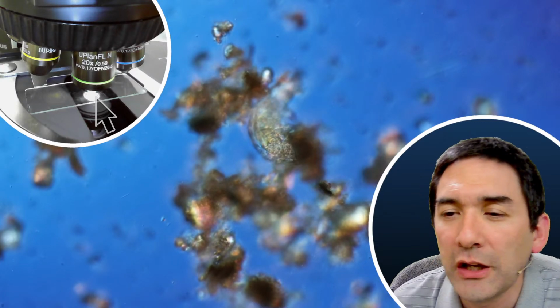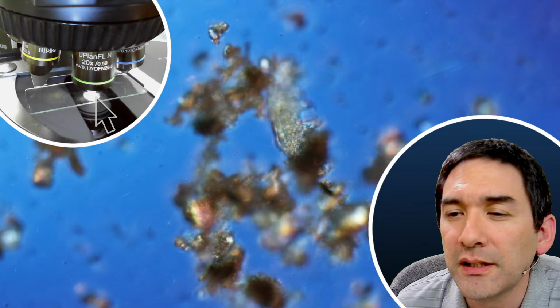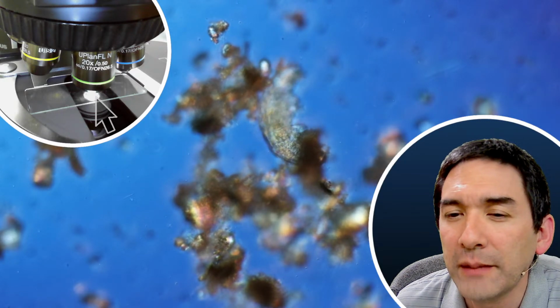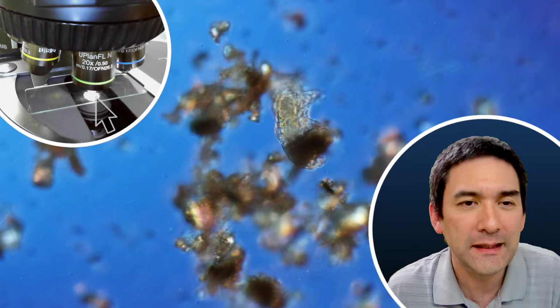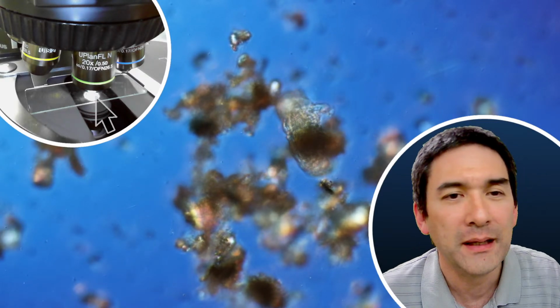So there is some communication going on in the chat, which is fine. So DIC optics can give the appearance of Rheinberg illumination. That's an interesting question from Micro Addict.